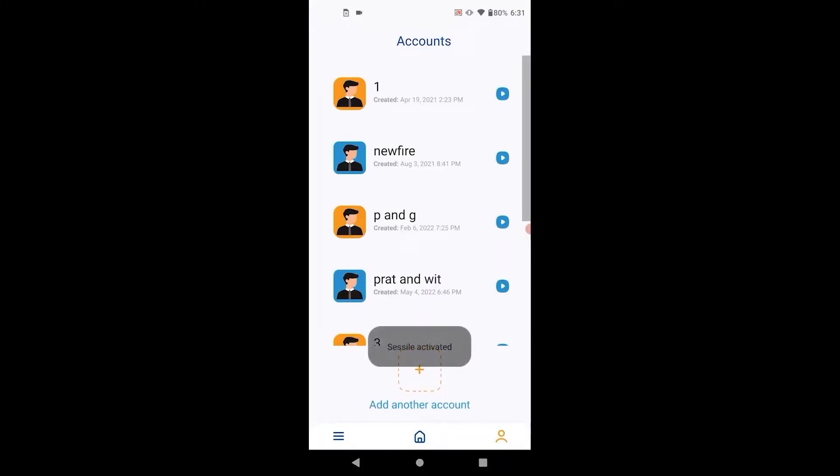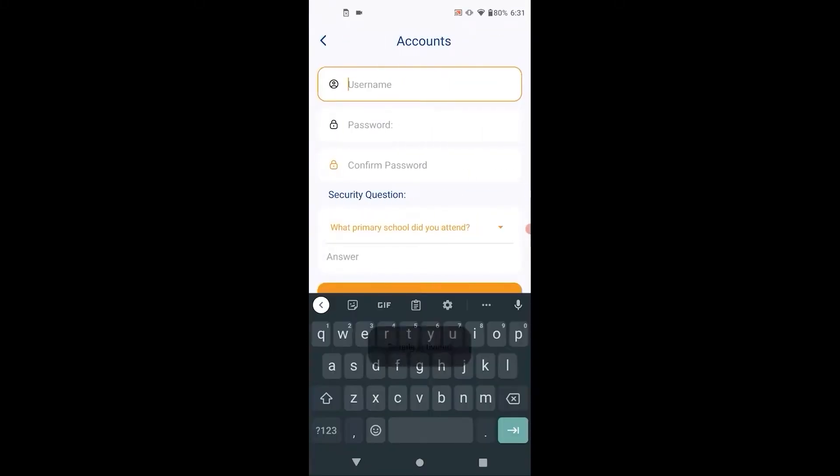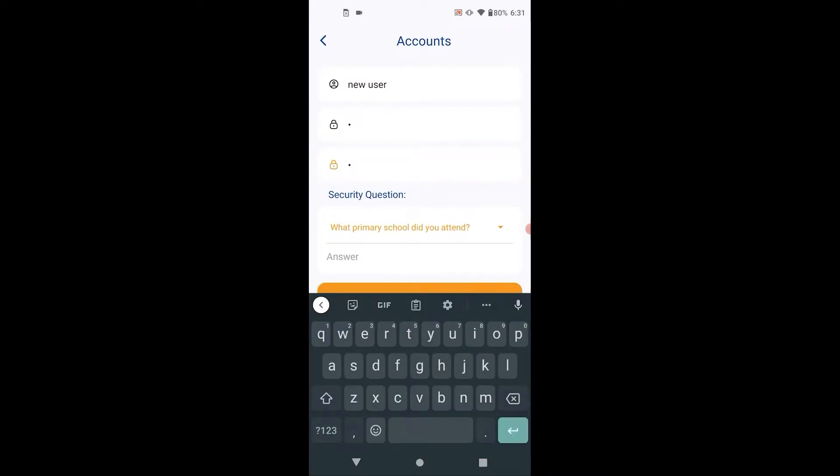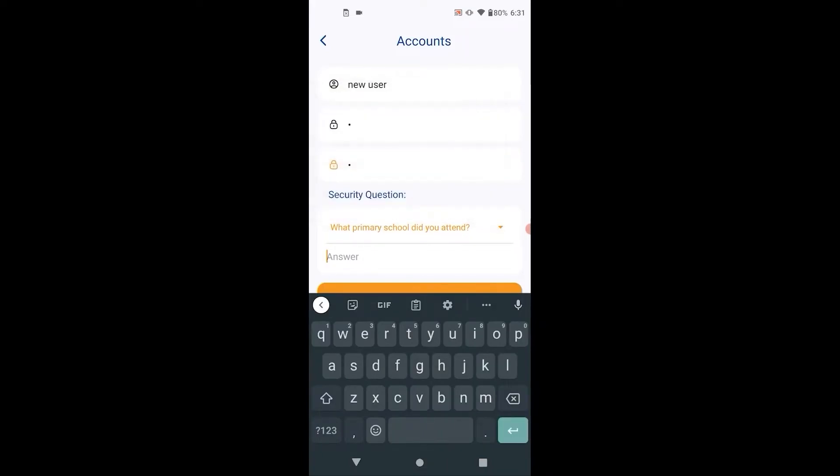First we create a new account. Choose the username and password. Confirm the password and security question for password recovery.